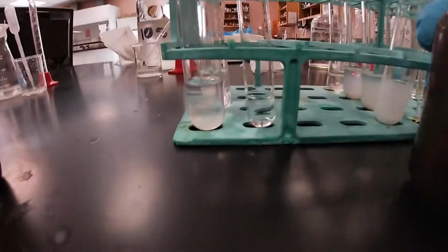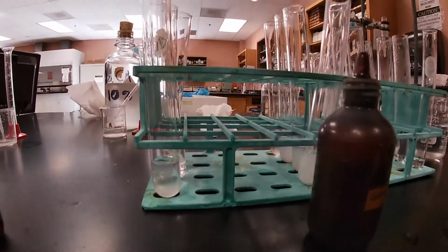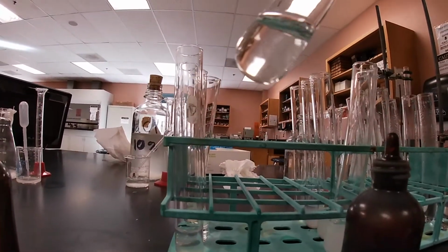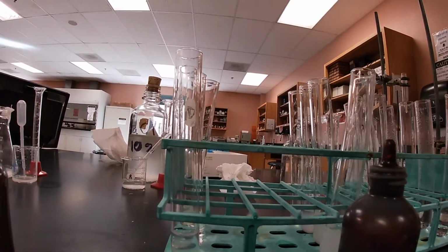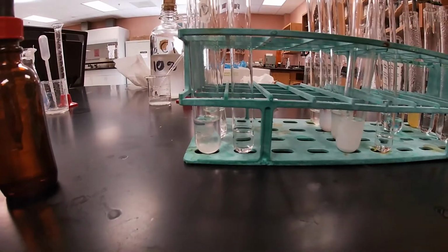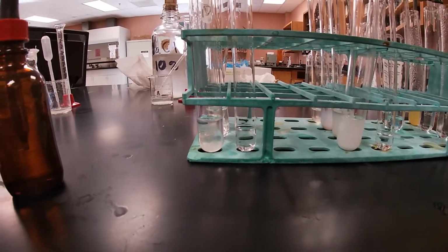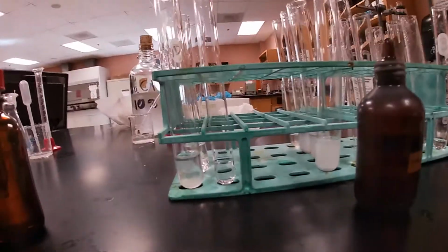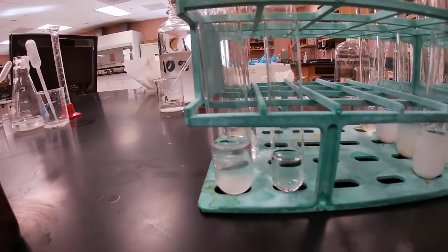And we added a few drops. No contents of starch. No blue film, like how we had in the last one. And a few more drops. No color change.